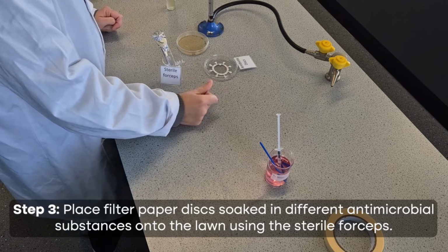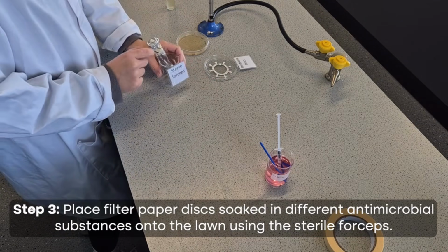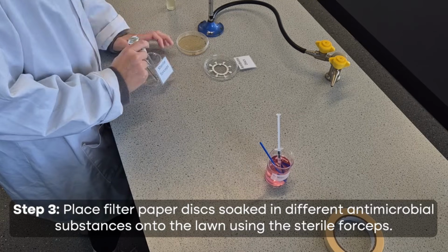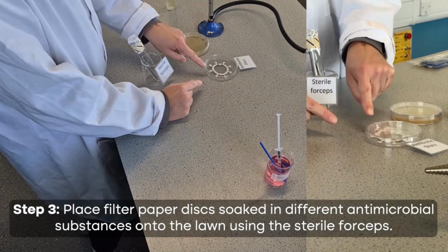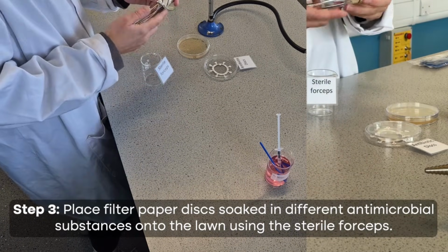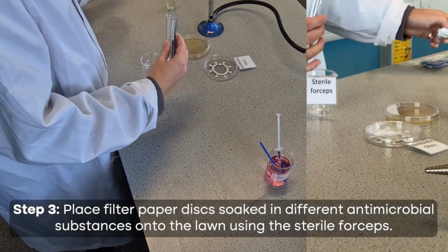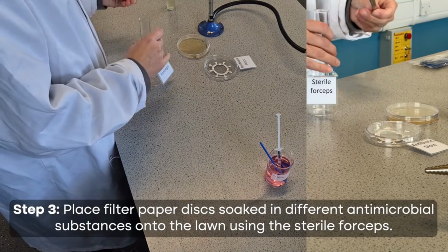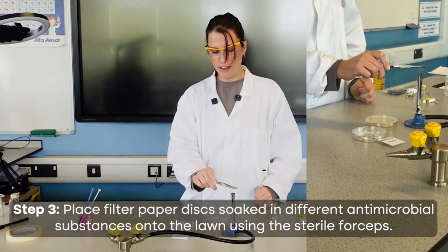Final step then is we need to put the antibiotic discs onto our plate. And this is where we're going to use our sterile forceps. Now you might not have an entire ring like I have here. They might just have individual pieces that they pick up and place on. But I've got the entire ring. Now these have been sterilized already. As soon as we take the top off though, they're now exposed and they might not be sterile. I would still actually put them through there just to be sure that they are definitely sterile.